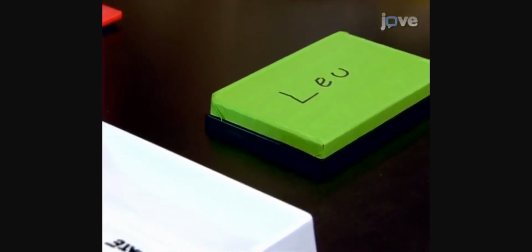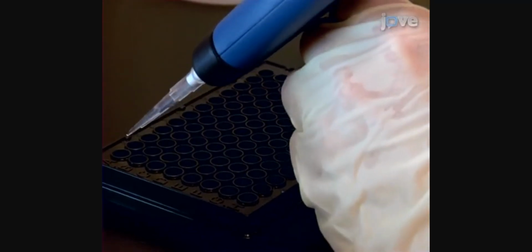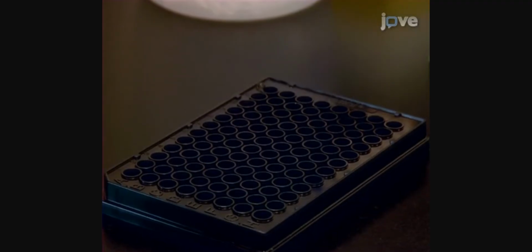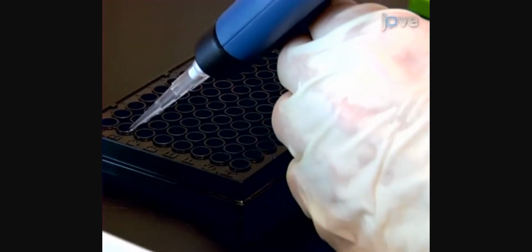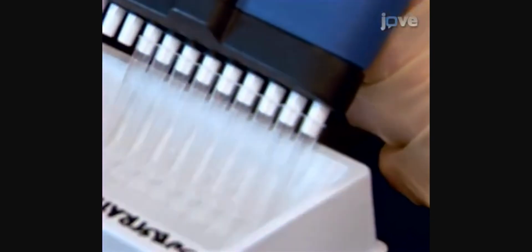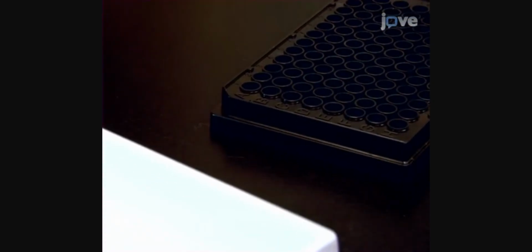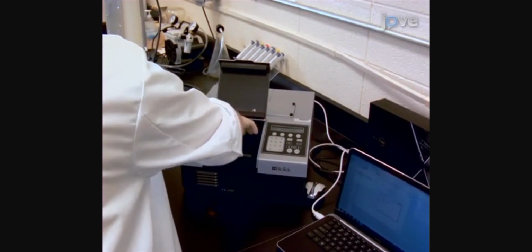Pour approximately 5 milliliters of the appropriate MUB-linked substrate into a clean pipette reservoir. Use a 12-channel pipetter to pipette 50 microliters into microplate wells 1 through 12 in row A and into wells 1 through 9 in rows B and C to form 3 replicate assays for each sample and 3 substrate controls. Immediately proceed to record fluorescence. Read the initial fluorescence immediately after substrate addition to the microplate.